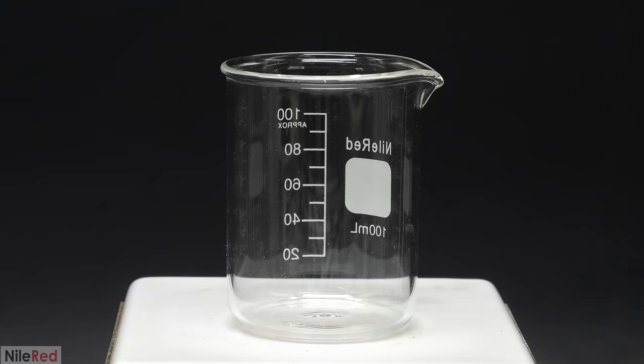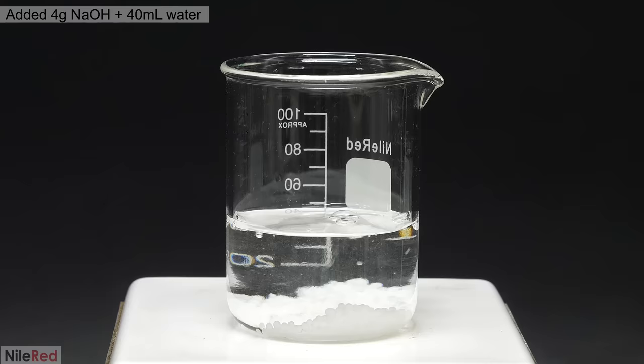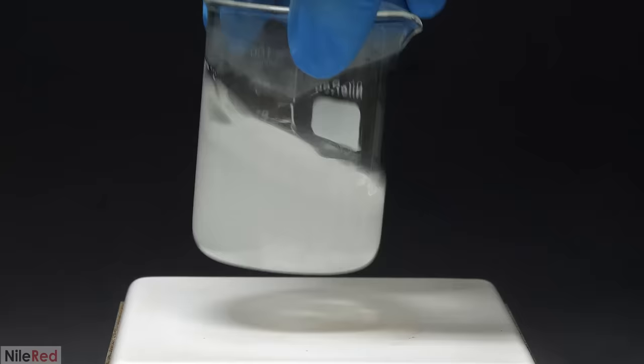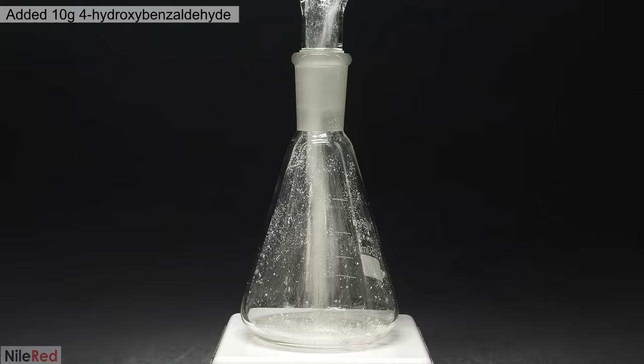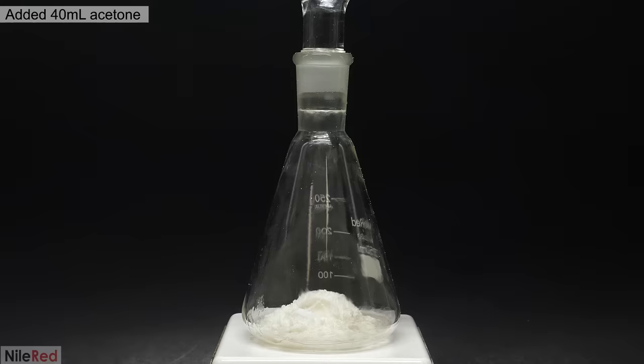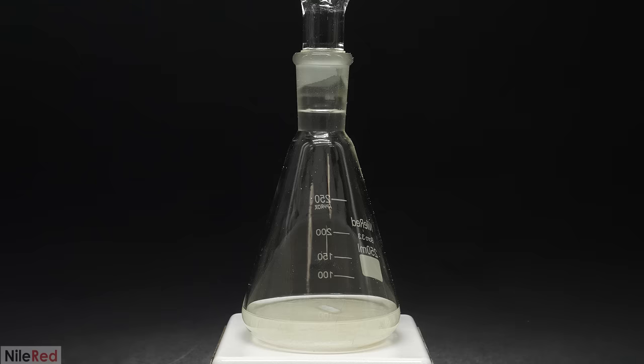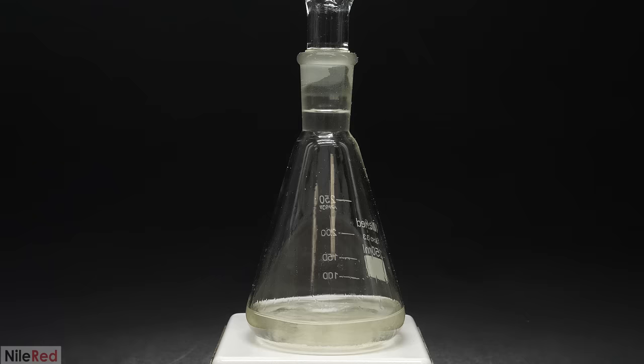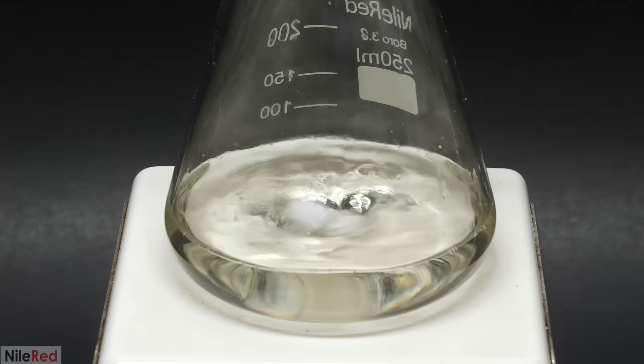With that being said we can finally get started. The first step was to make a dilute solution of sodium hydroxide so I added about 4 grams of it to a beaker followed by 40ml of water. I then got a flask and dumped in 10 grams of the 4-hydroxybenzaldehyde. On top of this I dropped in a stir bar and added 40ml of acetone. It quickly dissolved a lot but to get the rest I had to turn on the stirring. In less than a minute it had all disappeared and I was left with this crystal clear solution.